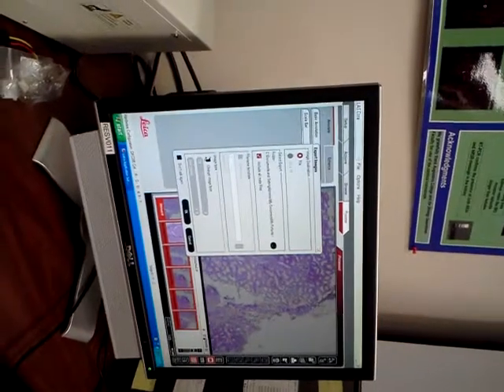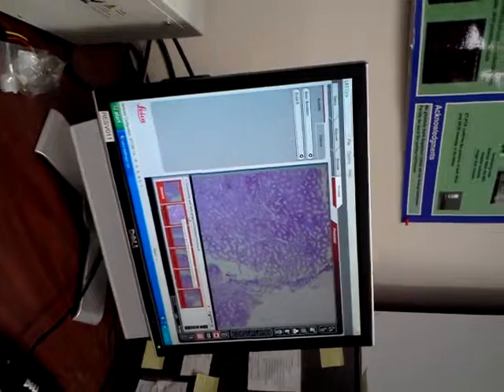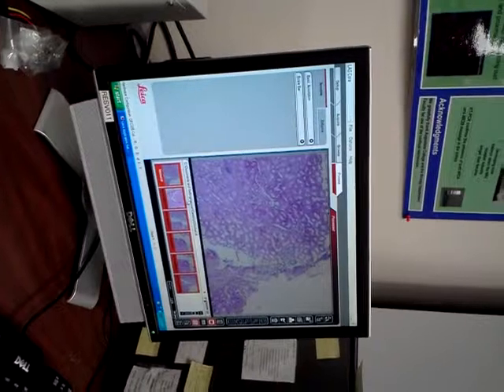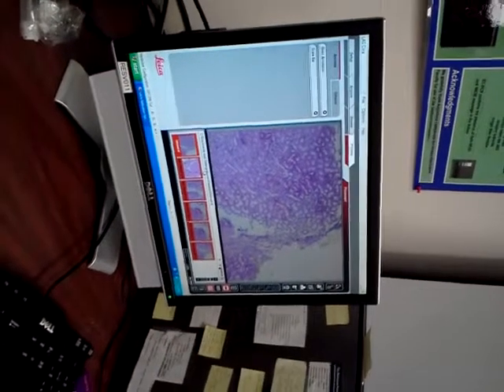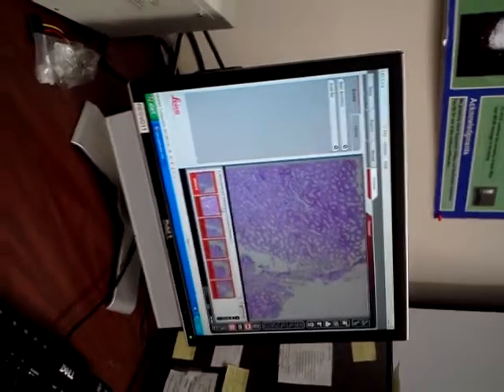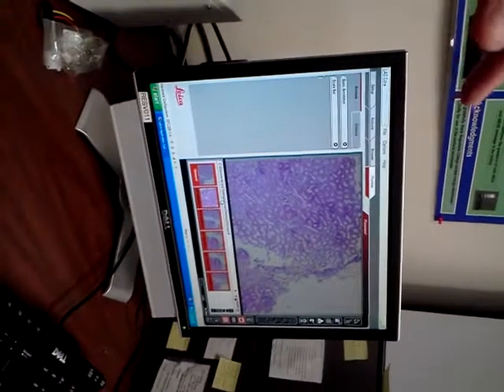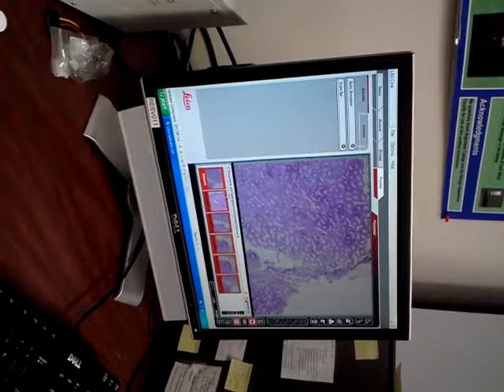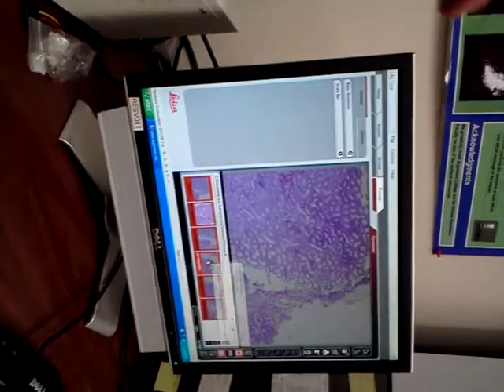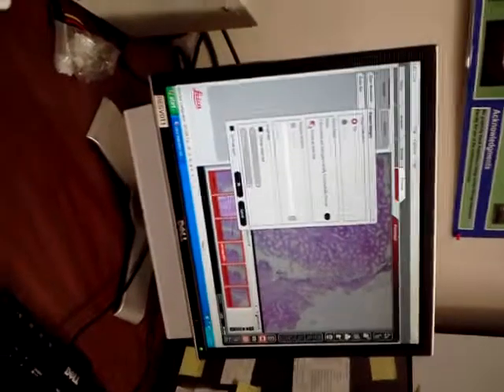And how about this software? There's kind of a traveling software that comes with the confocal that we've used. When you want to do some image analysis using the native software, it's almost like a shareware program. Zen has a Zen light. So I could install this on my desktop and pull up the images in the same program for any processing. Yes. If you were to export these to open on a different computer, like your own, in this program, you would want to make sure you included the meta files, because that way you could of course do all the measurements on your computer.